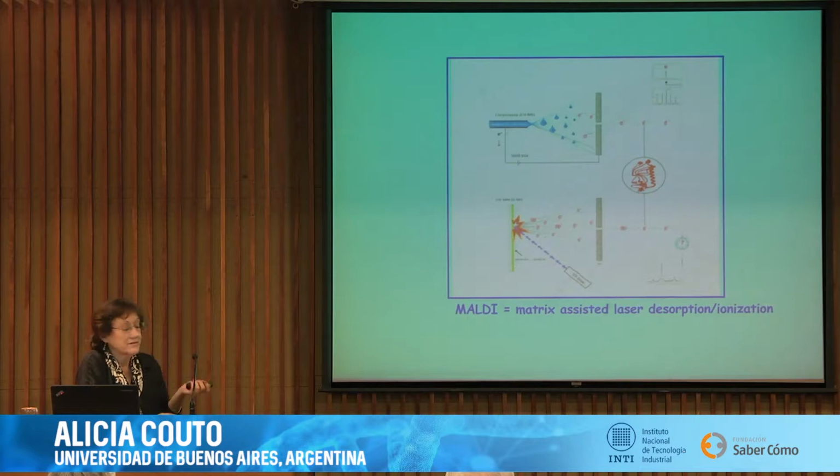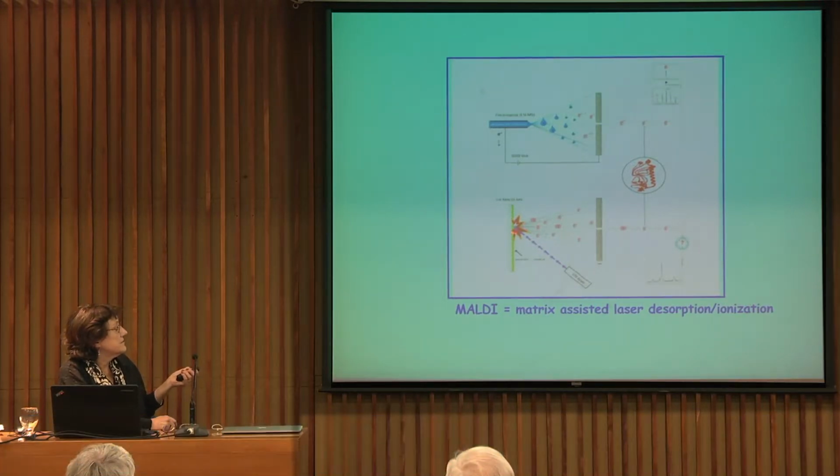It is a matrix-assisted laser desorption ionization system, where you put a solid sample analyzed with a photosensitive molecule called matrix, and the energy passes from the matrix to the analyte, and they produce the desorption and ionization.